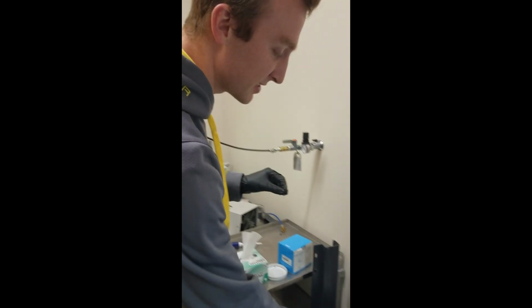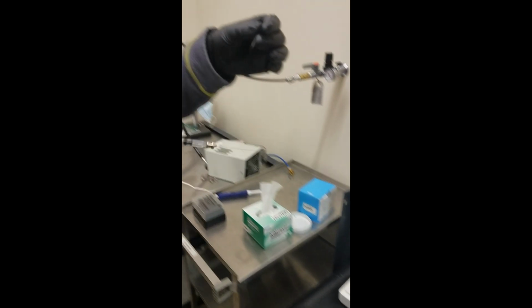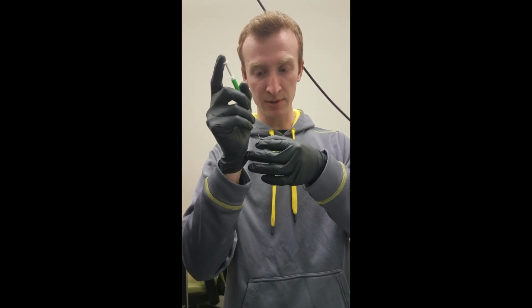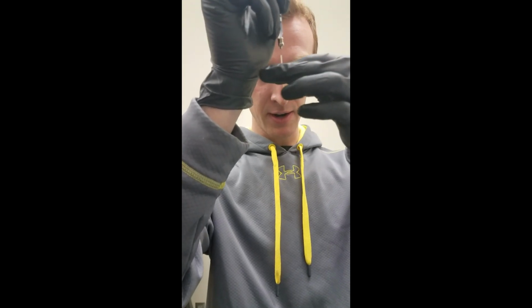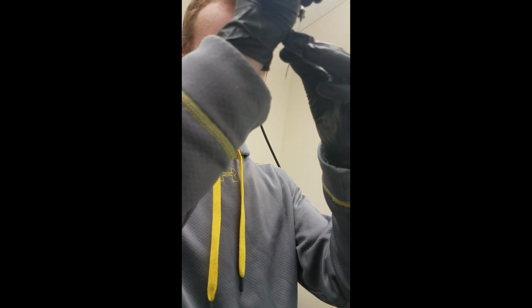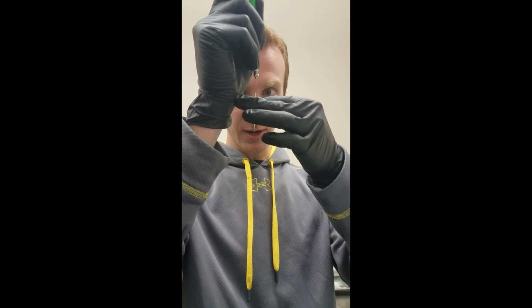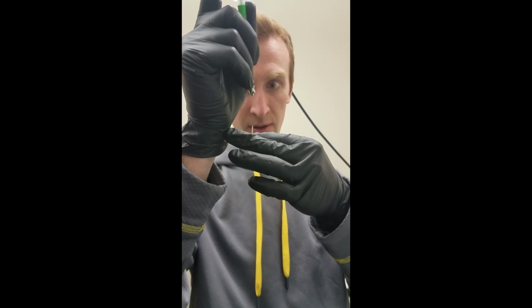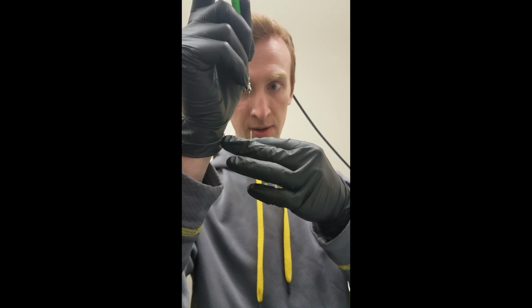So to do that, you take this sterile mineral oil, and you have to fill the needle with mineral oil, making sure not to leave any bubbles. So I like to go all the way down to the very tip and slowly inject some, and then just fill the needle as you pull it out until the entire glass tube is full of mineral oil.